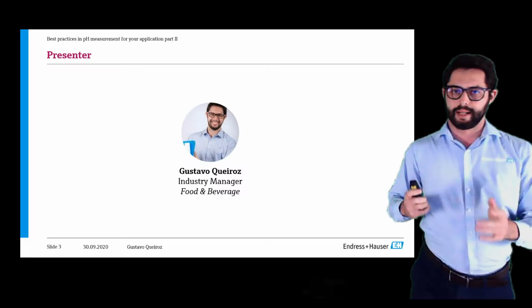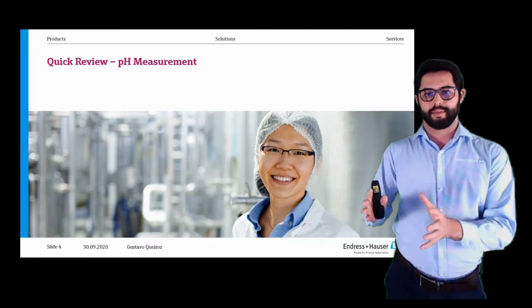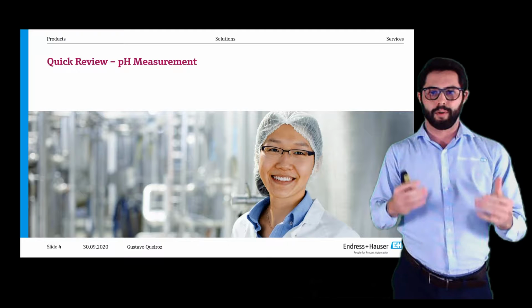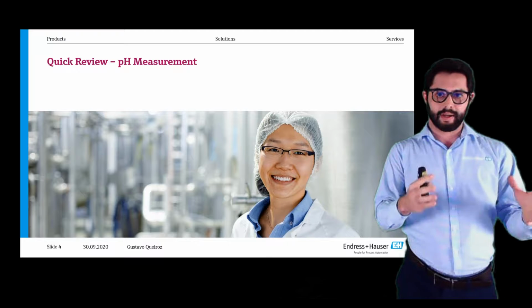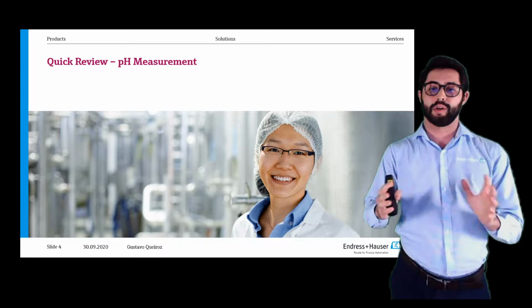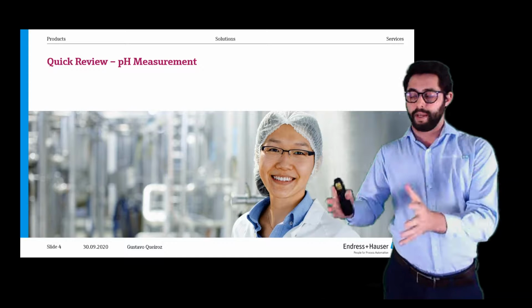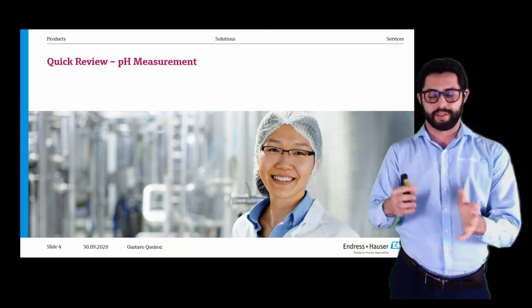So let's get straight to the point. Before we talk about the technologies available for pH measurement in hygienic processes, I just wanted to give you a quick overview on how the pH electrode works. We won't go as deep as we went in the first part of this series, but I really just want to highlight some of the key topics and ideas we need to have in mind to understand what makes a pH electrode suitable to be used in a hygienic process or not.